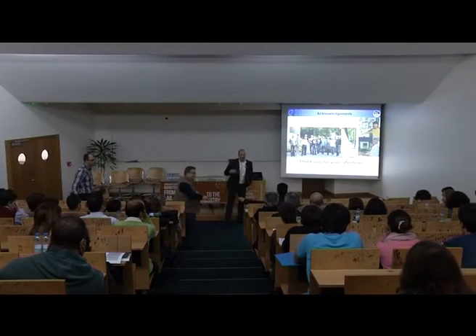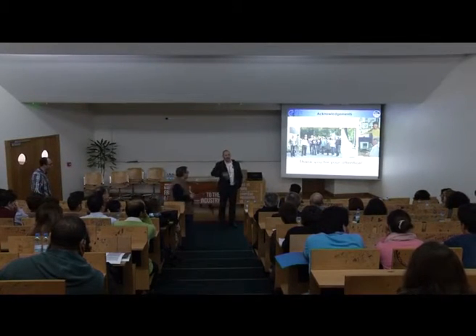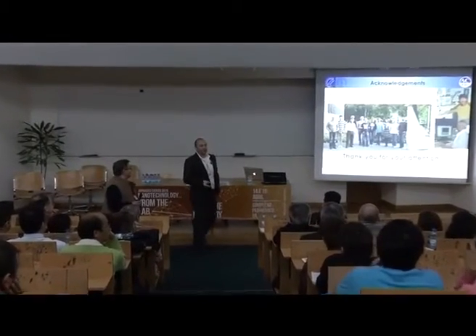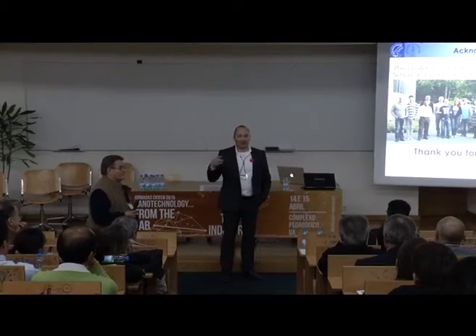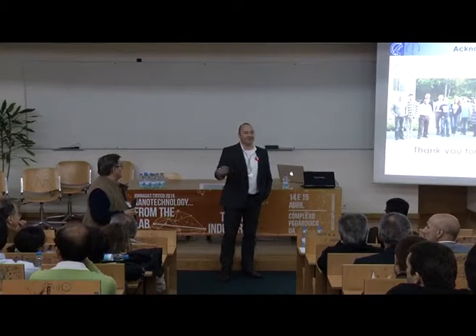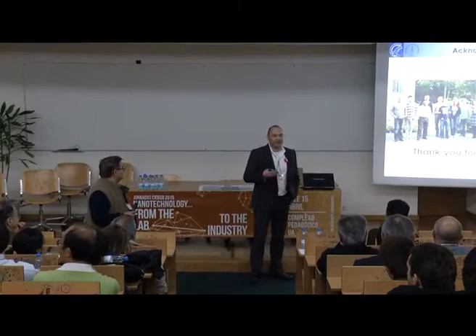In the microscope, we are always limited by resolution. We use a scanning microscope, so depending on how much signal to noise, how good the quality of the scan should be, we have different scanning rates and different time resolution. But also the acquisition of spectra in XPS, for example, takes several seconds. So now you can play with the thermodynamics of your reaction, slow it down, maybe you change the temperature, or use some species that are not so active, but then you change the whole system again and you add new complexity that you don't understand. It's clear, it is a limitation.